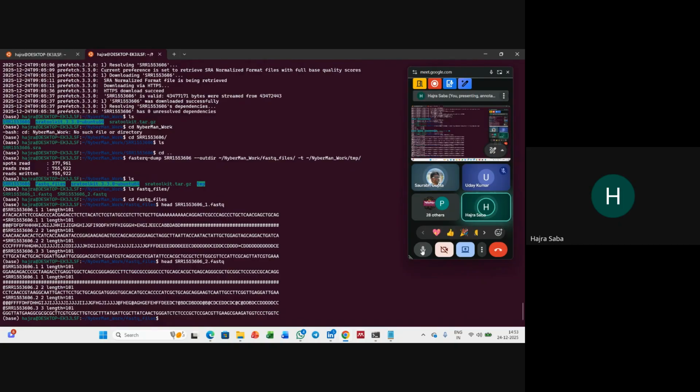Everything clear, everybody? Can you please repeat the last part again? I didn't follow, my internet was bad. Okay. So you remember we had this paired end sequencing data, like how I had shown you earlier. So this _1 and _2 corresponds to that. The _1 file contains all the reads from the read1 component and _2 contains the reads from the R2 component of it. Remember how the fragment is sequenced from both sides in the slide that I had shown you today? So this is how it is stored.